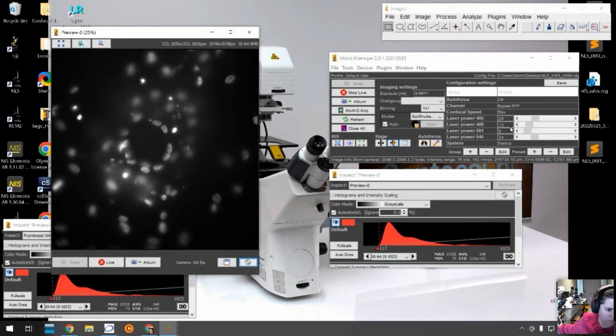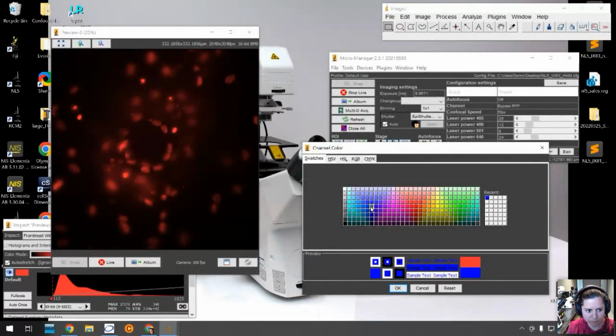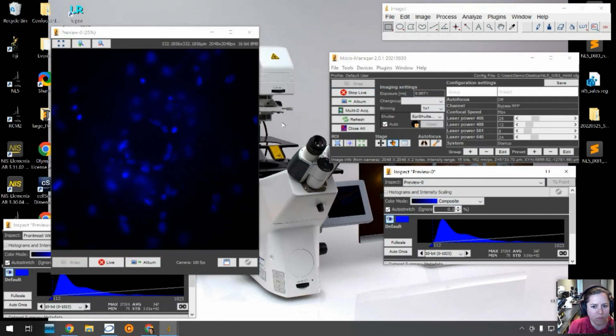Yeah. So let's see here. I will change the color to maybe blue. Okay, and I will stop live imaging.